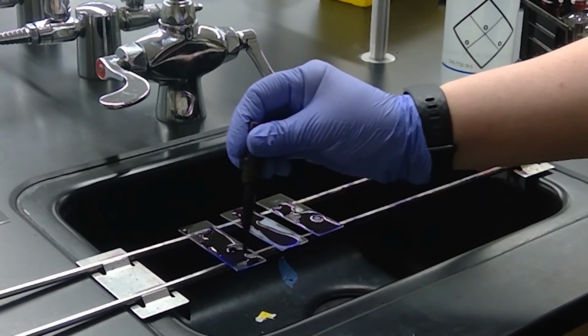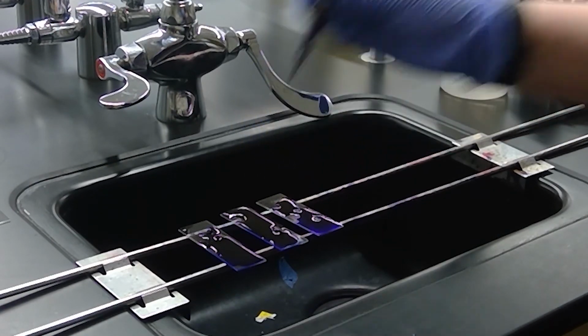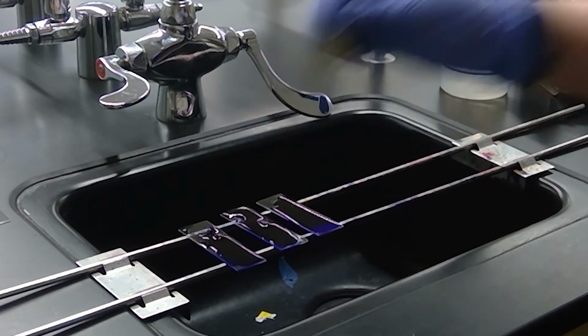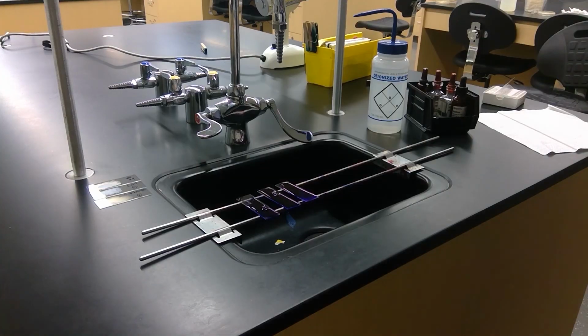Then you just want to cover any spots that you missed. I know it seems excessive, but you don't want to have mixed results. So now we'll wait 1 minute.